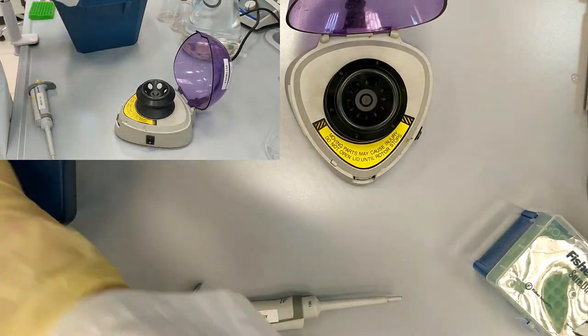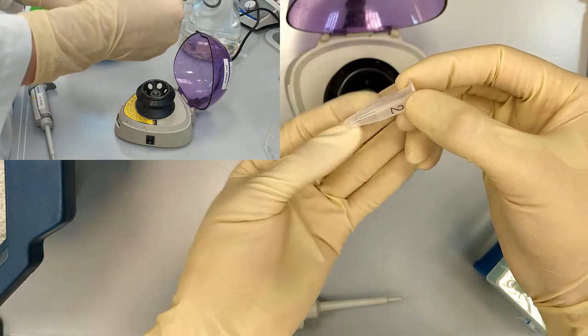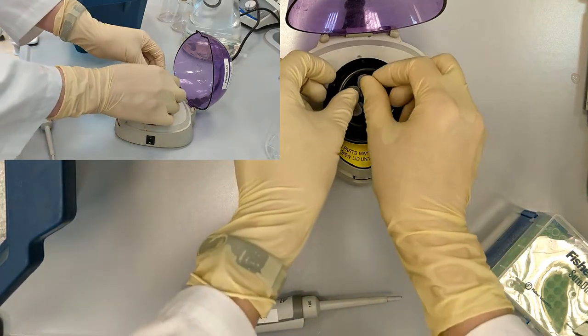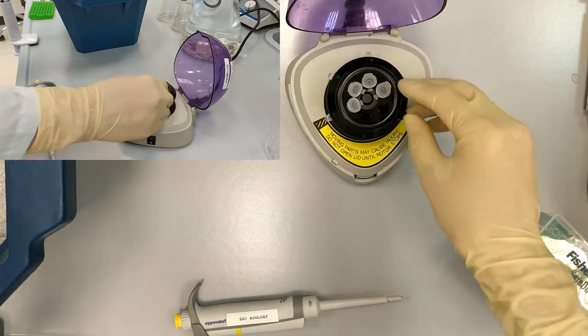Okay, so now we need to spin down everything so that it is on the bottom of the tube. We are going to place them and pulse spin them.